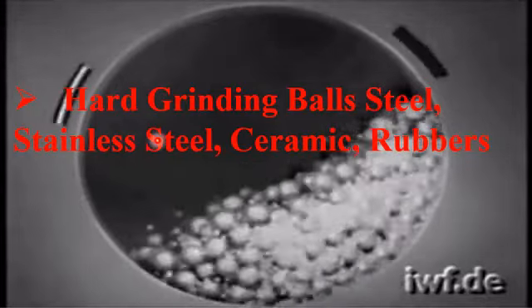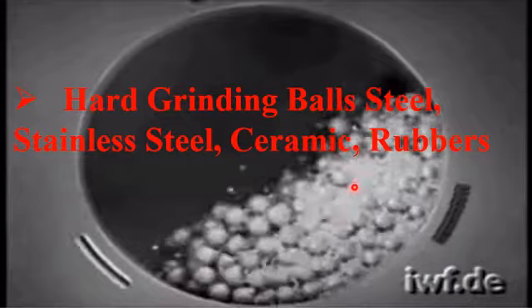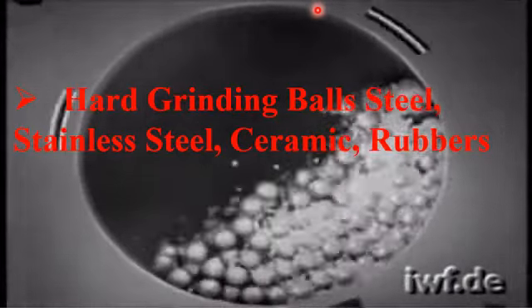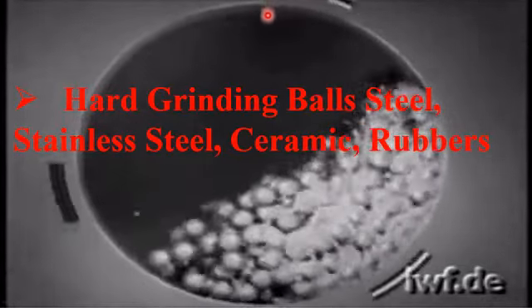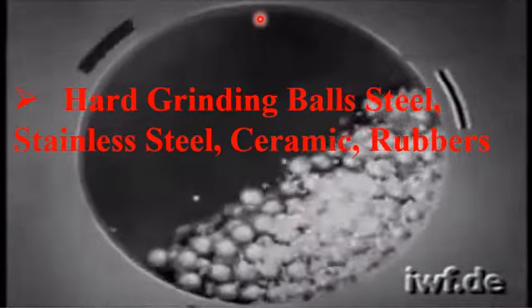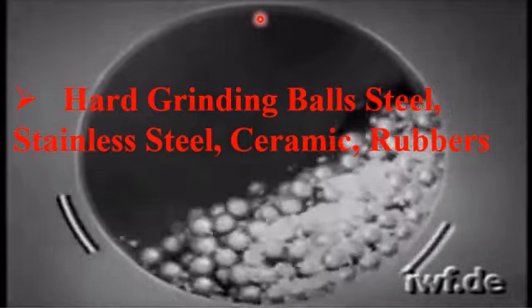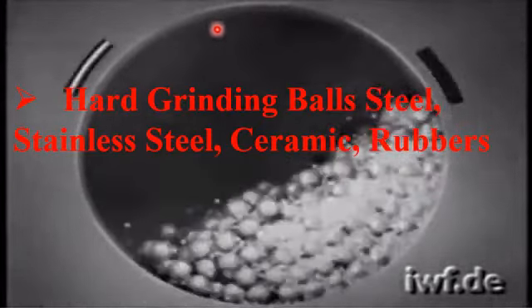Please note that the ratio of the balls present inside the hollow drum of the ball milling apparatus to the initial precursor or bulk material is 2 to 1. This ratio may vary and may reach up to 20 to 1, but it depends on the material which we want to crush.